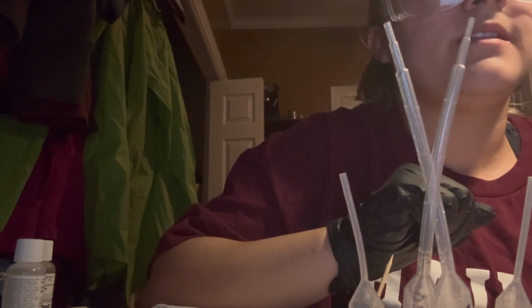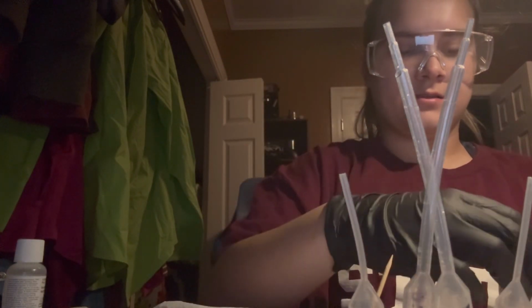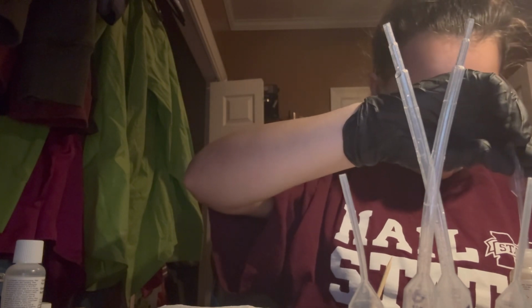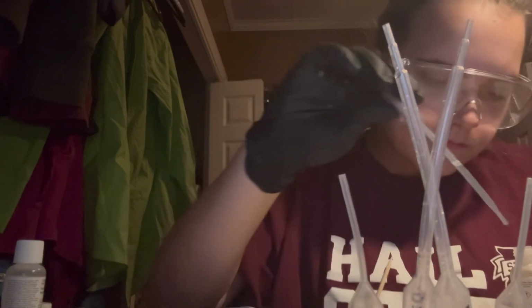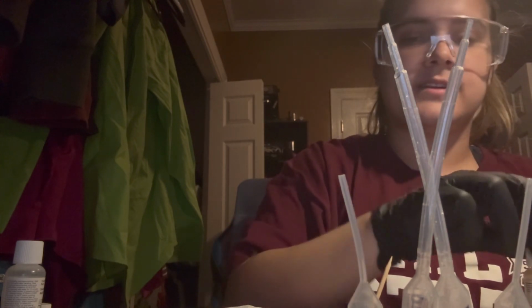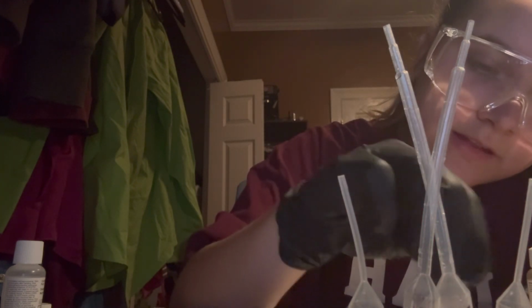So 1 drop of 6 M HCl. Here's the HCl. Here's my HCl pipette, and we'll be adding 1 drop of this into the distilled water. Alright, and then we stir the solution with a clean toothpick. So here's our other clean toothpick, and we'll stir the solution, and we'll dispose of this toothpick afterwards.